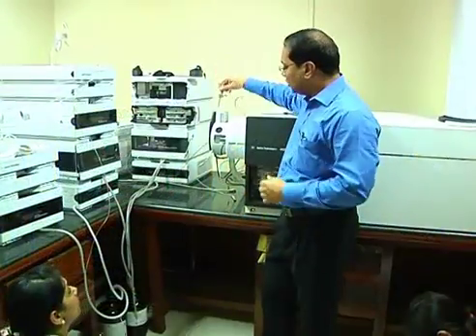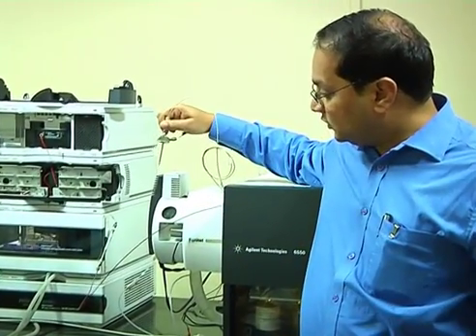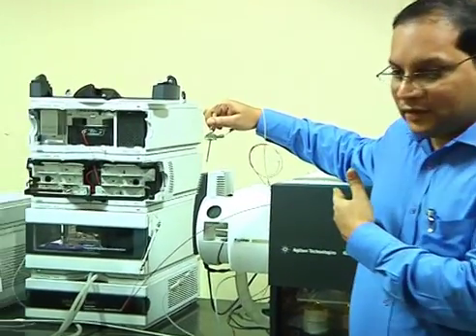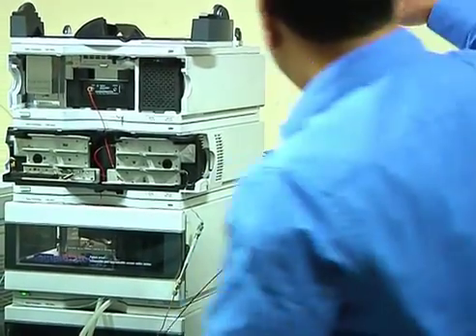Nitrogen has to be an inert gas, otherwise it would react and form something else inside. This is how the spray will happen. I showed you the droplet, and now you see the spray. You could see it.